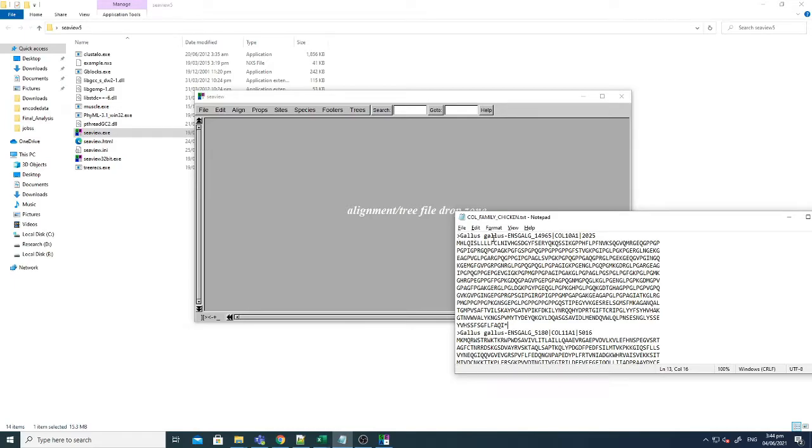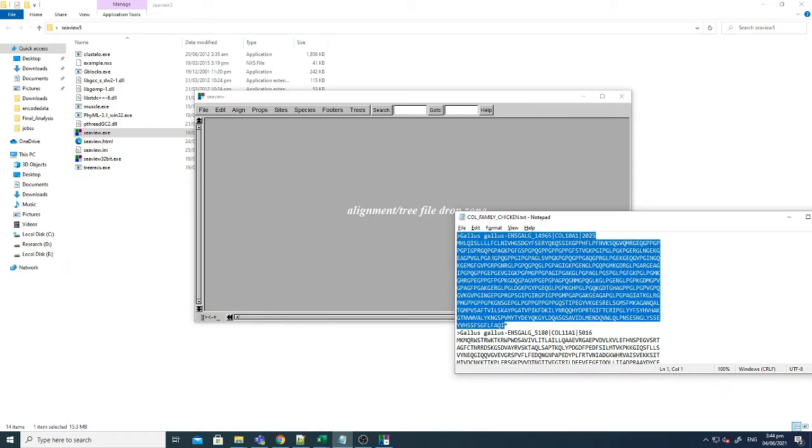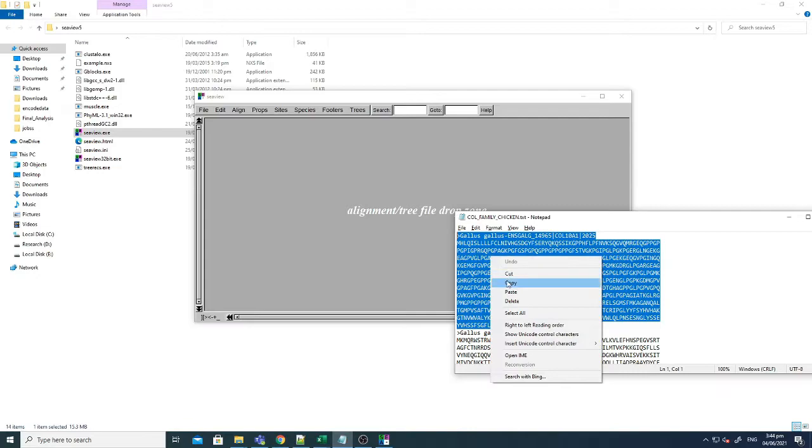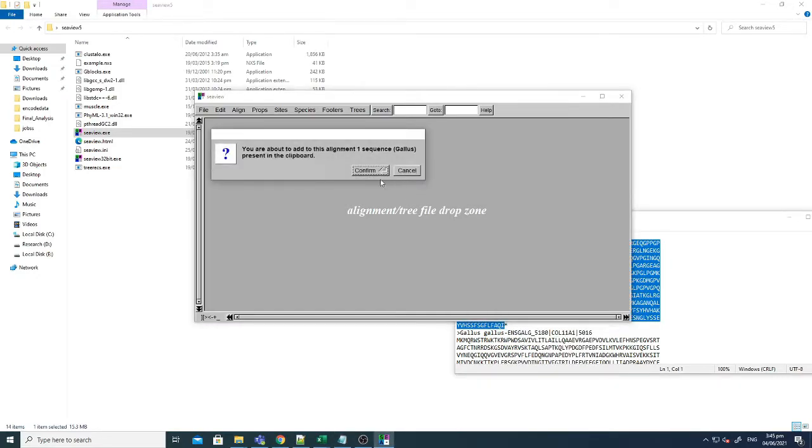Right, so here you can see that there are family sequences of chicken. Gallus gallus stands for chicken and this is the Ensembl gene ID and this is the collagen 1a gene. So I'm just copying the FASTA format here, just click copy and come here and just paste it.